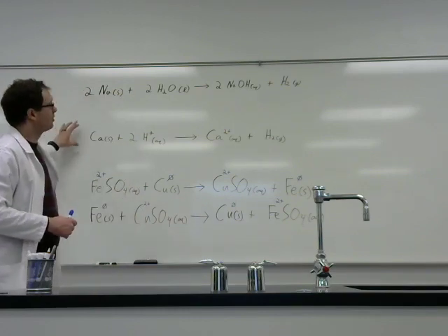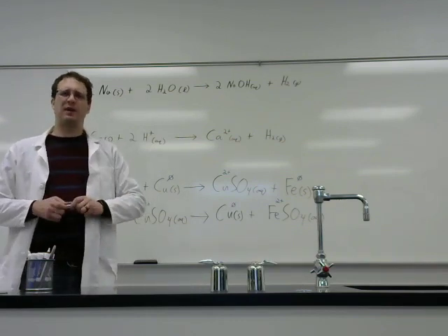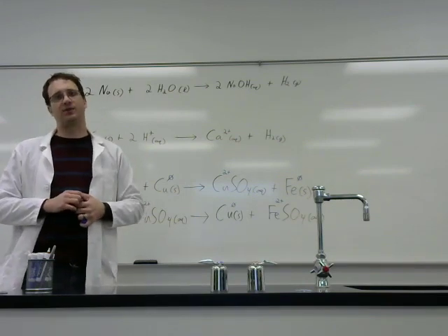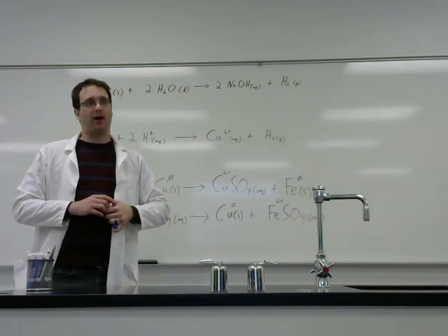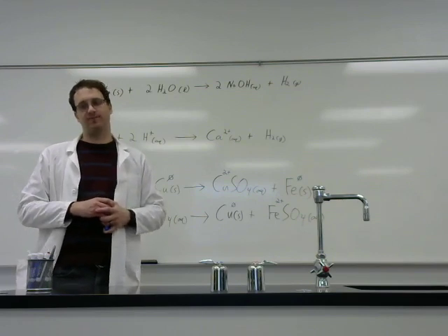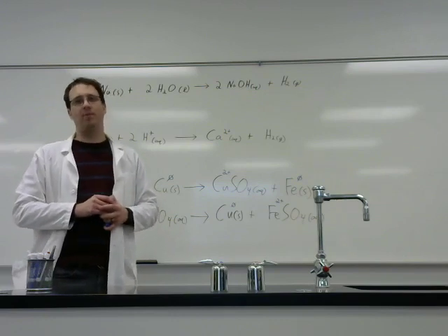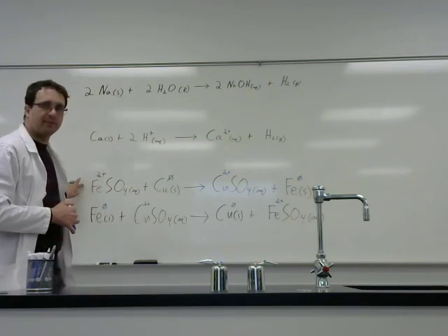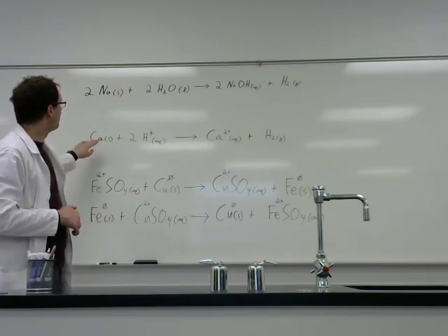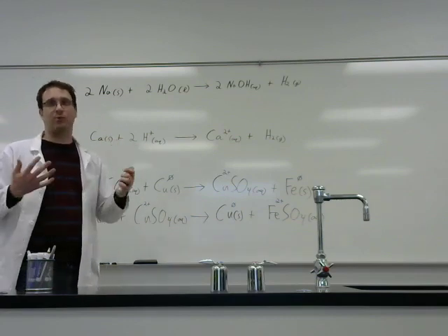For the first 2, the reaction of metals with water or acidic solution, then we'll be able to just observe how vigorous the reaction is. Some of the reactions will happen almost violently with bubbles pluming out of the reaction. And some of them will happen slowly, and some may happen not at all. With the metals, we can begin to build an electrochemical series in the same way by reacting the metals with acids and seeing which ones are going to react more vigorously.